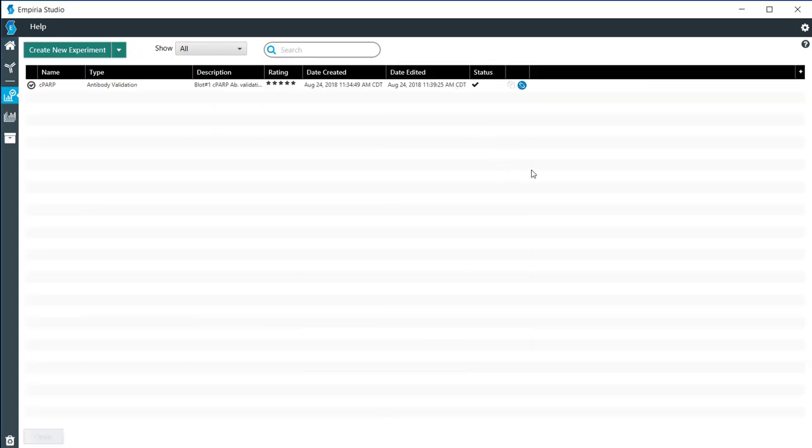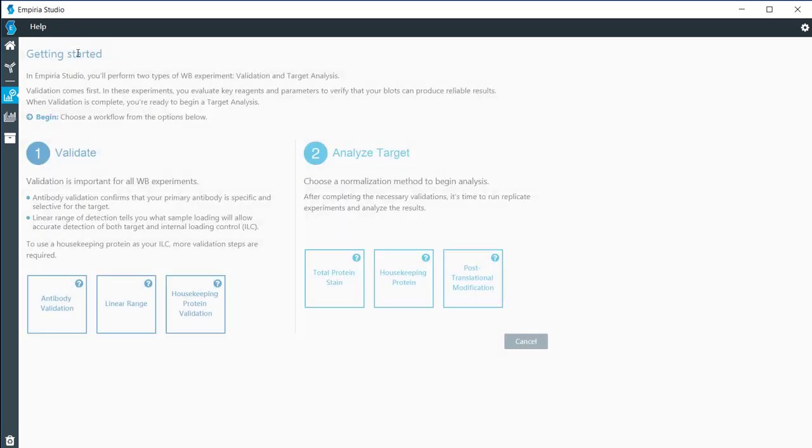I'm going to open up a project that had already been started and click on create new experiment.